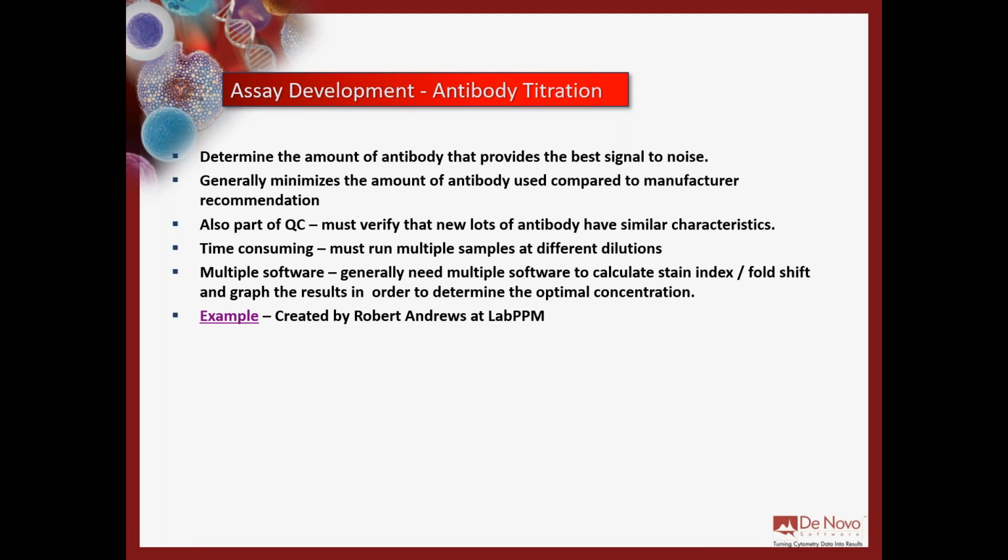Antibody titration with other software is generally a very time-consuming process. You run your primary flow analysis in one software. You either copy and paste, export, or type a bunch of the statistics into another software. You then might run a regression curve or something like that in the other software. You then have to copy and paste images to make some sort of report, and document all three softwares together so that you know how you arrived at your final titration values.